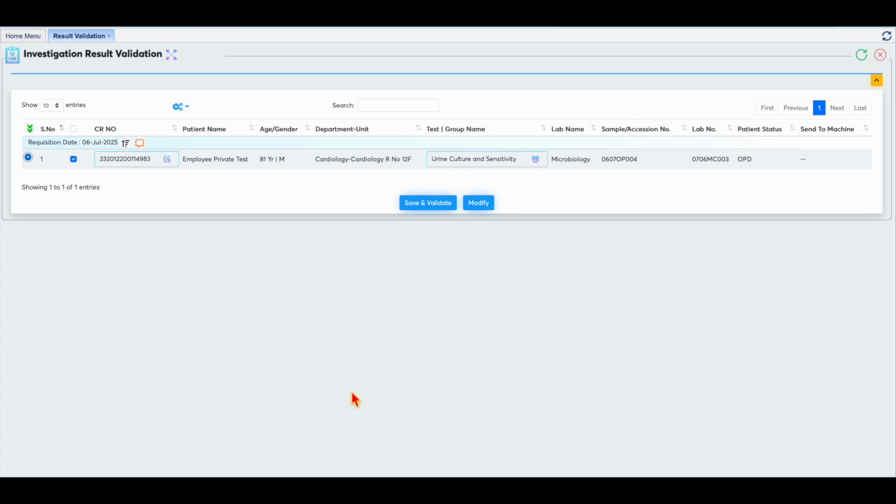HMIS training video. In this video, we see a result entry has been done for a microbiology culture test where the antibiotics and the organisms have been done. In case any modification is required at the time of result entry or in validation, we see how to modify and validate the antibiotics for which results were entered.